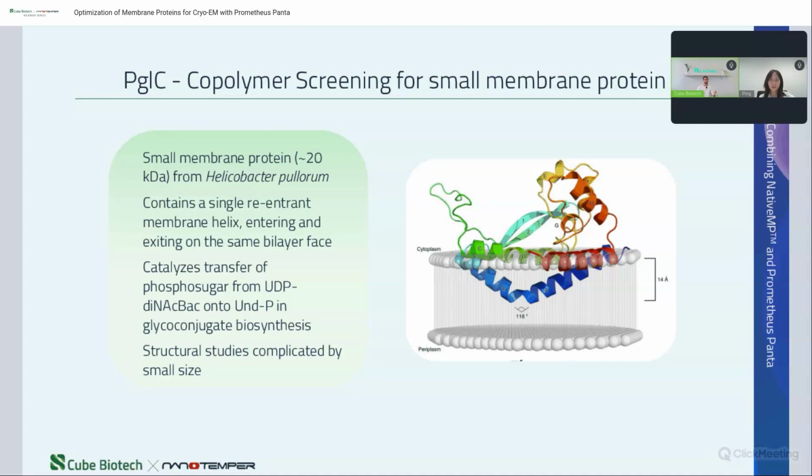Proteins like this tend to have low signal in cryo-EM, and slight aggregation or polydispersity can completely derail all your efforts. Exactly. To my knowledge, for single particle cryo-EM, the size threshold is generally around 50 to 60 kilodalton, and anything smaller becomes extremely difficult to align and classify due to insufficient contrast.